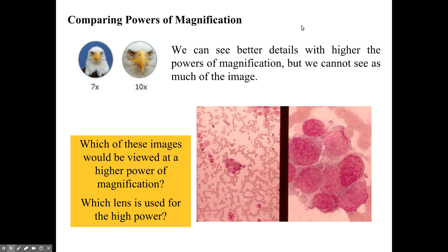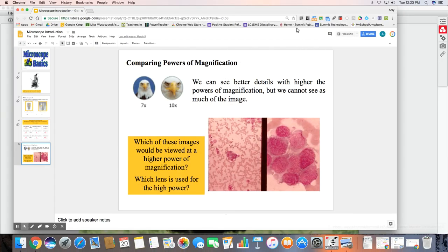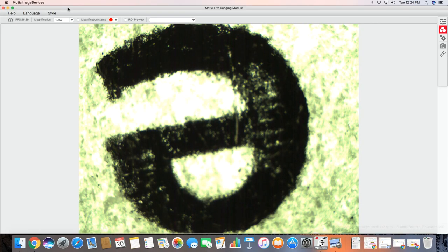Now I'm going to show you what our microscope can do using the letter E lab that we did in class. I'm going to switch views here and we're going to take a look at the microscope. So if I put a letter E under the microscope this is what I would see.